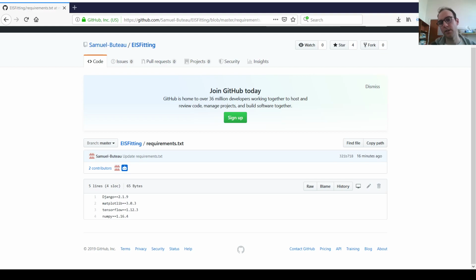So if you try to install something again, it will just say that it's already installed. The reason I've already done this is just because it takes a lot of time, or it took a lot of time when I tried it previous time. So at this point, let's say we also did the pip install matplotlib==3.0.